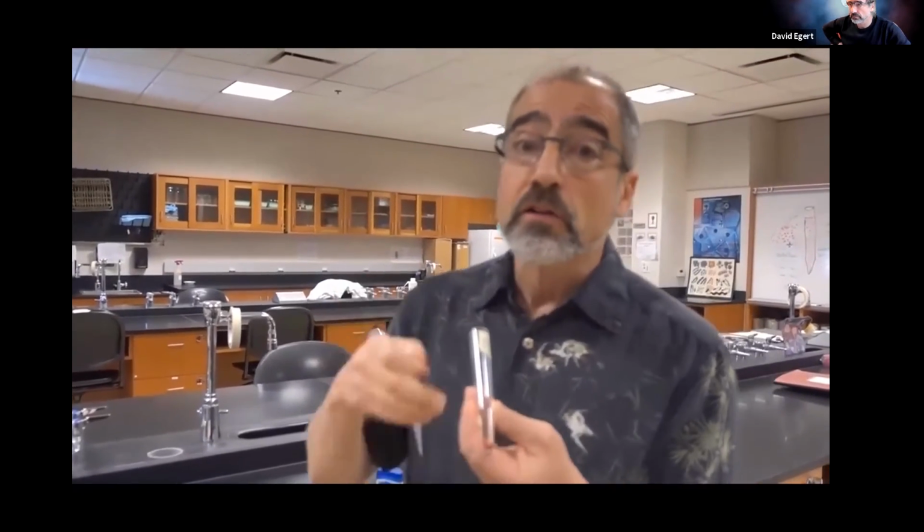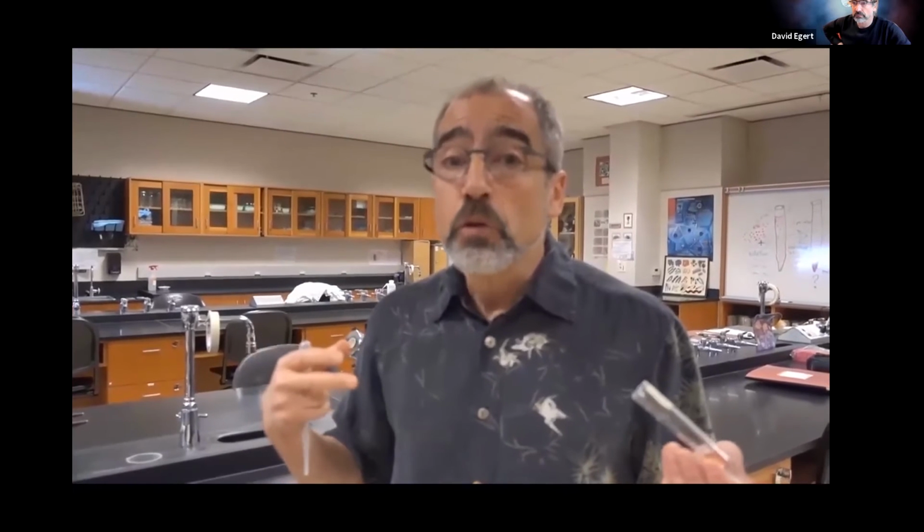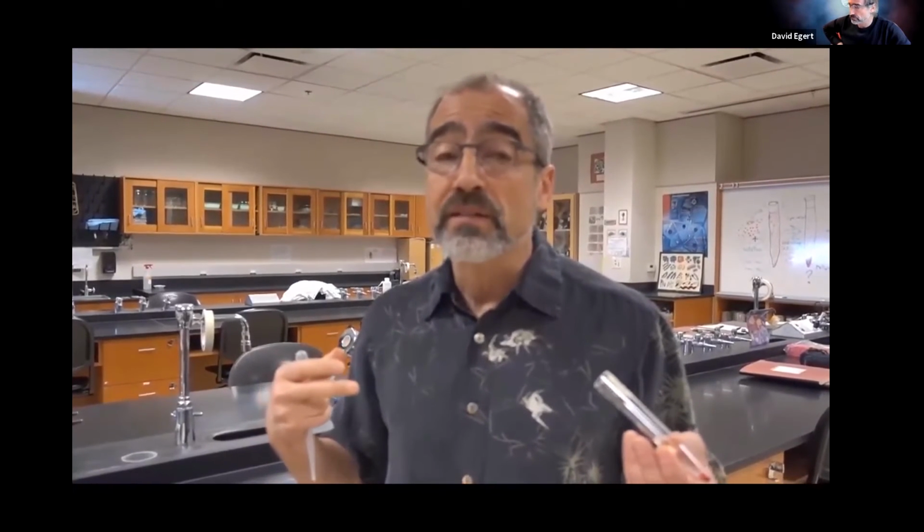You don't want to totally mix it back up. If you put too concentrated blood cells on a slide, it's hard to see any single blood cell. It's like if you're interested in looking at a grain of sand, but you're looking at a whole handful of sand, all you're going to see is just crazy sand grains everywhere. So you want to just suspend a few of them.